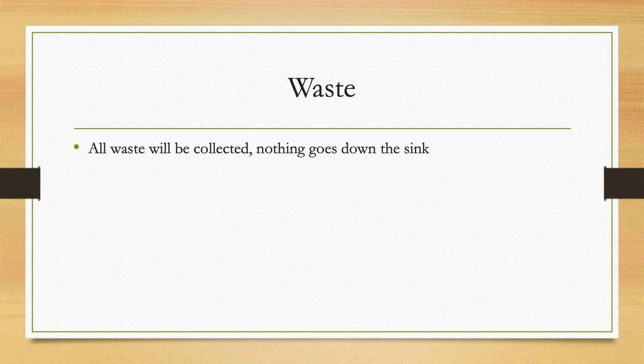Last couple notes on waste for this lab. Nothing can go down the sink. Naphthalene, for those that don't know already, is the main ingredient in mothballs, so they stink pretty bad. It's not something we can actually put down the sink. We have to have specific waste collection for it.